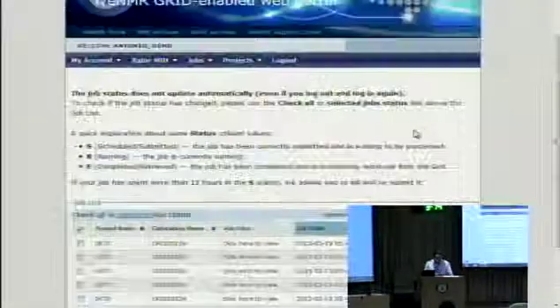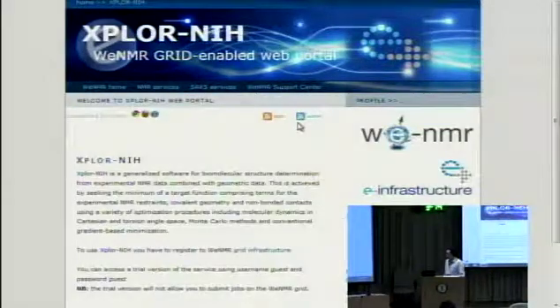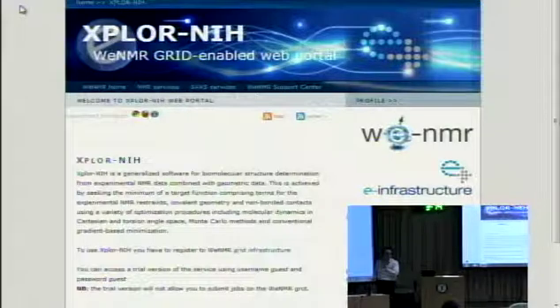Okay, meanwhile, we can just move on and see how the Amber portal for refinement works. So when the calculation of this structure will have finished, we will be able to retrieve the corresponding PDB. And if we want to do that, and as I say, I think it's always very worthwhile to do it, we can send it to the Amber portal for refinement.